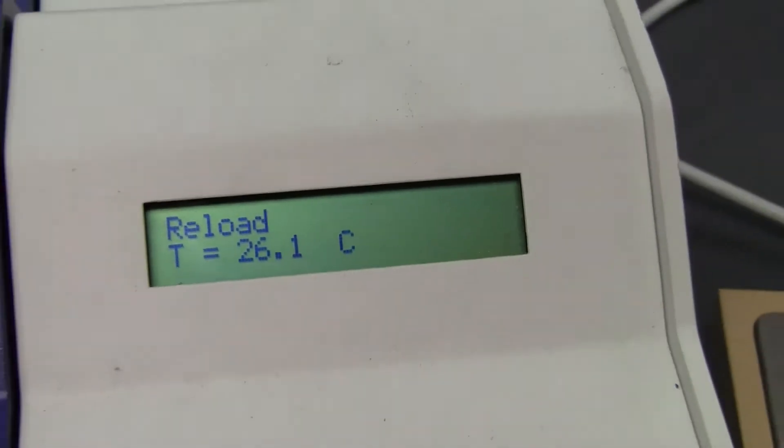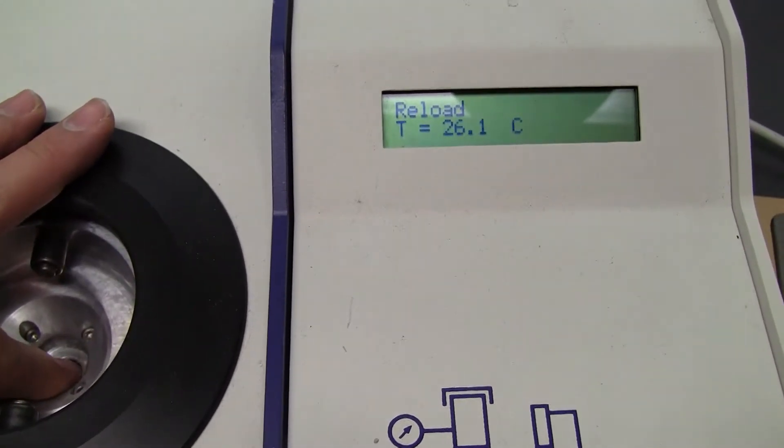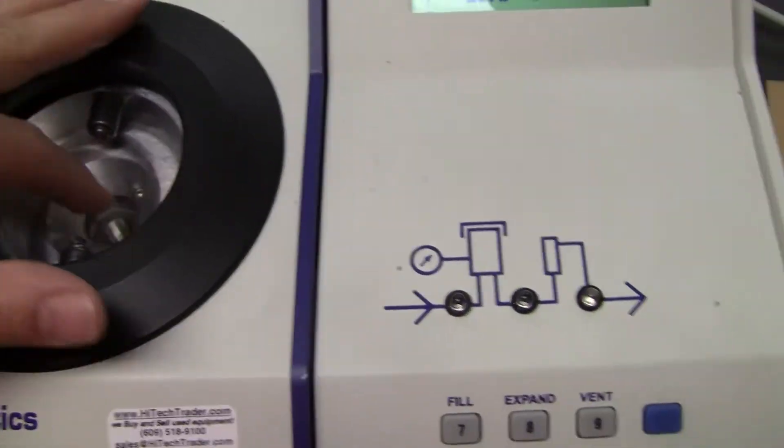I'm seeing the pressure and temperature. I can change the pressure on the cell by just pushing down on it a little bit. See it change there, just putting a little load on it.